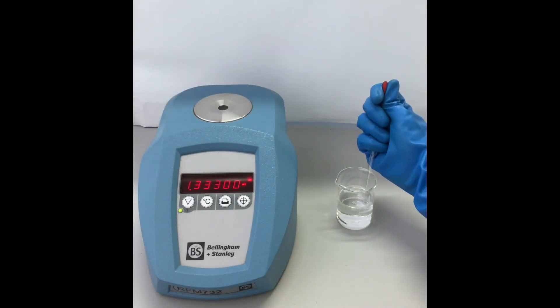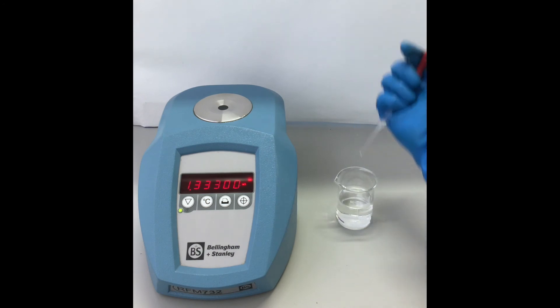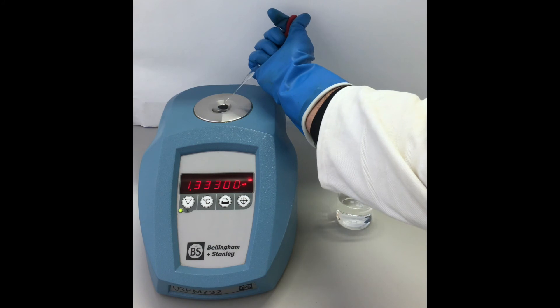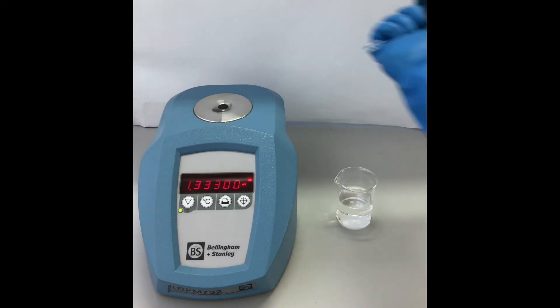To perform a sample measurement, apply your liquid phase sample directly onto the measuring prism and then press the read key. Make sure to take note of the reading displayed.